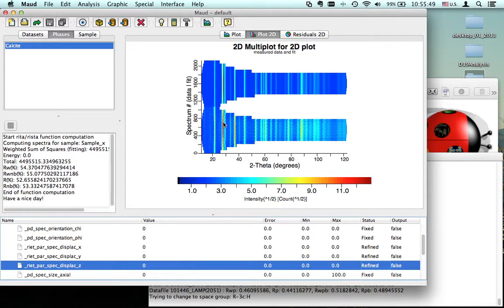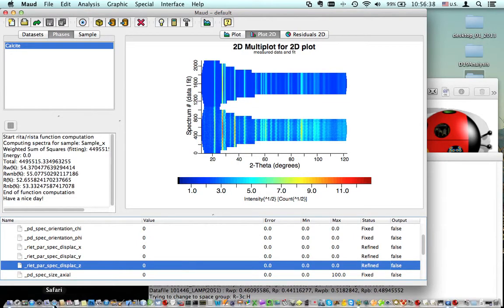If the sample is displaced from its centered position, then this will cause a waviness. The program, based on all the different angles, is computing how the sample is moving and the error that this will cause on the diffraction pattern, both with phi turning and with eta. Then if we set how large the sample and the beam are in the two directions, X and Y, we can also decide.